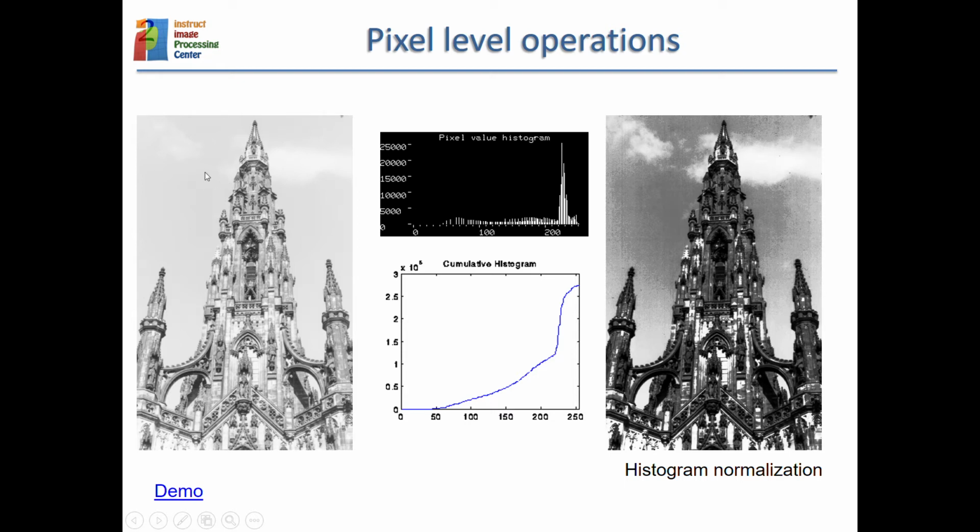So this image had a lot of bright values, in particular in the region somewhere around 220. It had a lot of counts. So this was, let's say, 220, this was 218. And then this little difference of 2 didn't allow us to see very clearly the cloud.